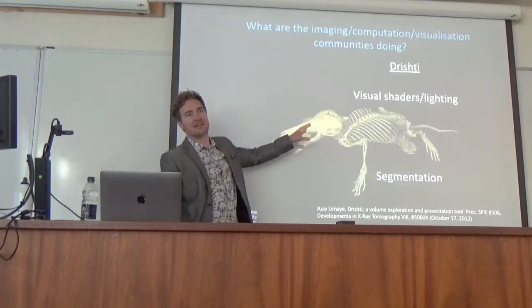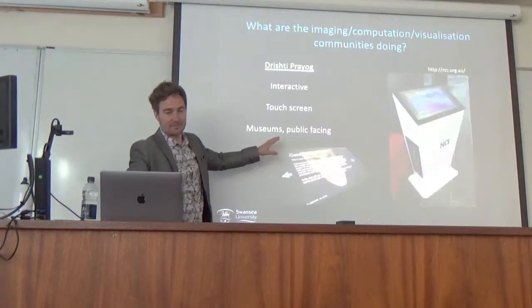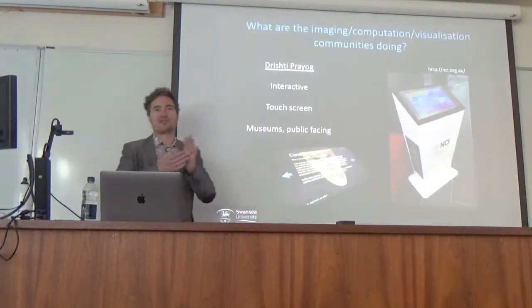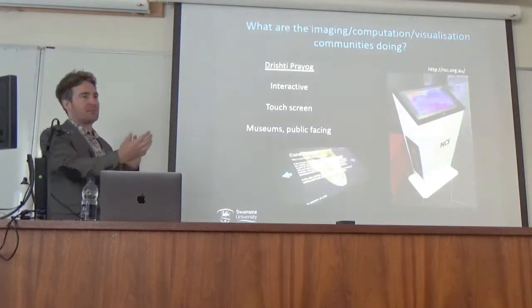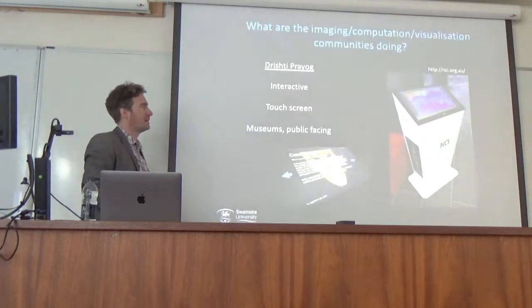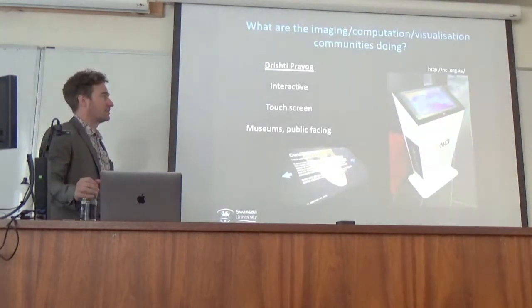It had skin, flesh, eyes, all of those things. But you could have that within the transfer function, so that with a swipe on the screen, you remove all that soft tissue and then reveal the bones. You have to do a little work beforehand to have those segmented, but effectively, that's what a few places are using this for. We did it a little bit.